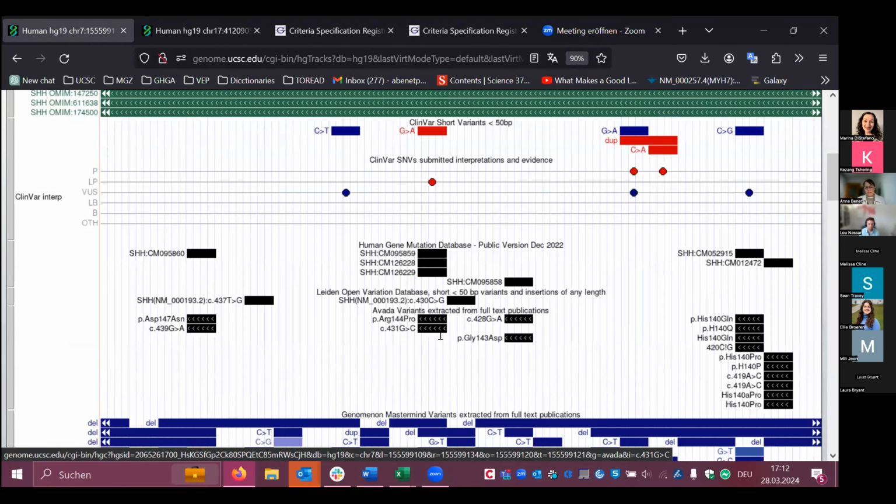No, okay. So what we did is we downloaded all these different types of tables and put them in tracks. This is the work that Lou did here. And I will show you now how these tracks look. So now I'm again in a kind of recommended track set in another session of the Genome Browser. And here we put together all the data from these different ENIGMA tables. So for example, this track here, you see it in the middle.